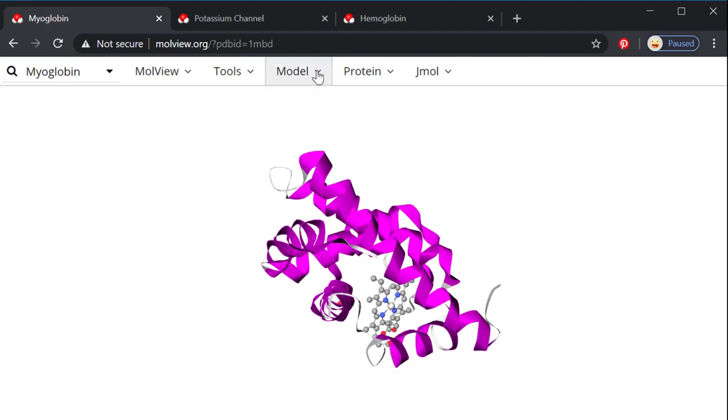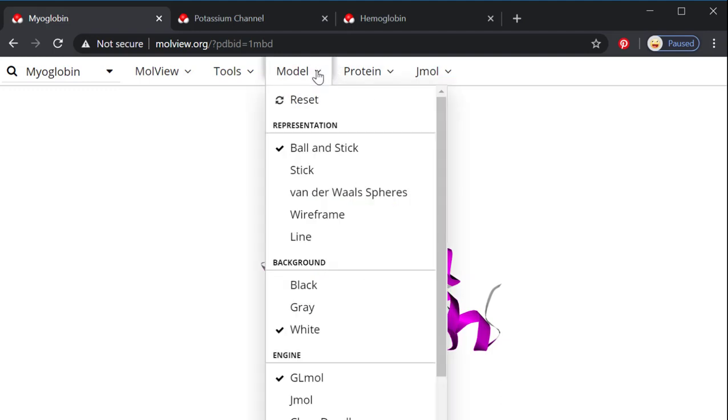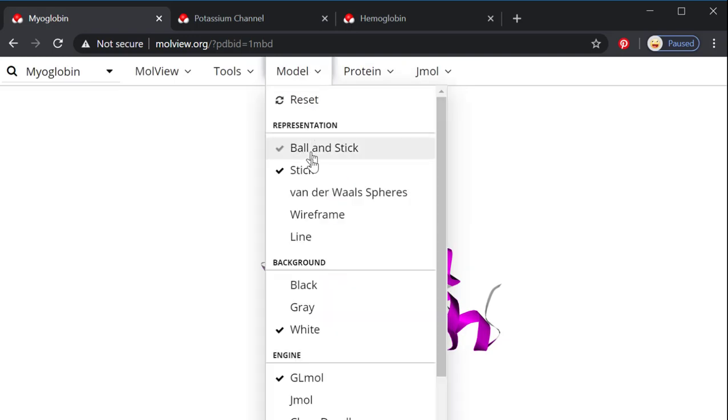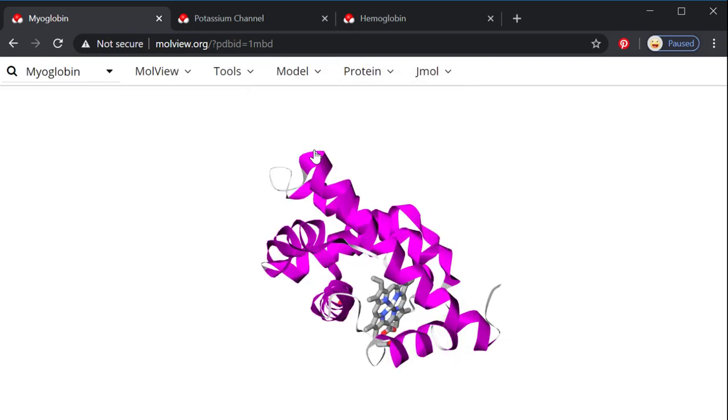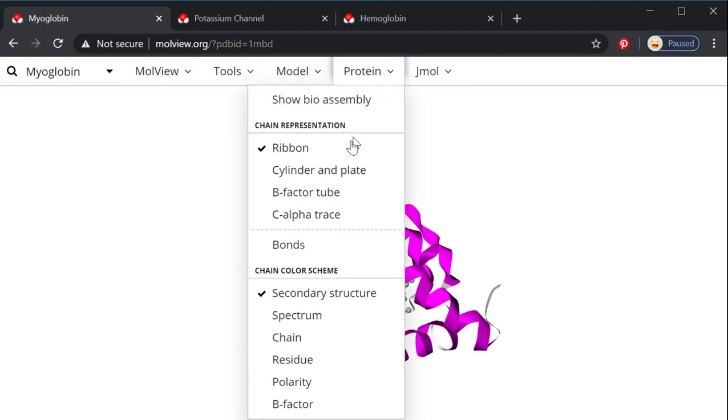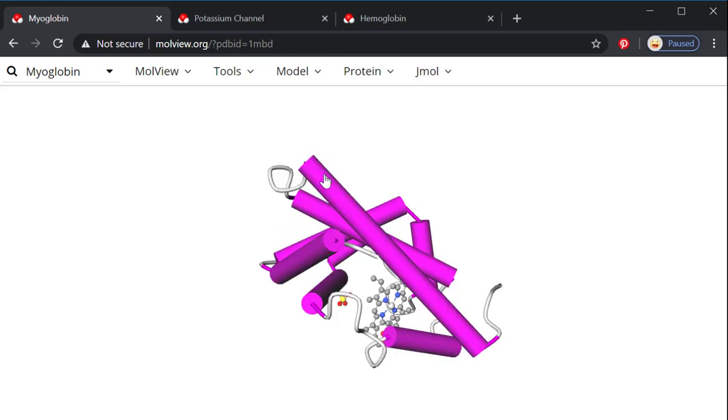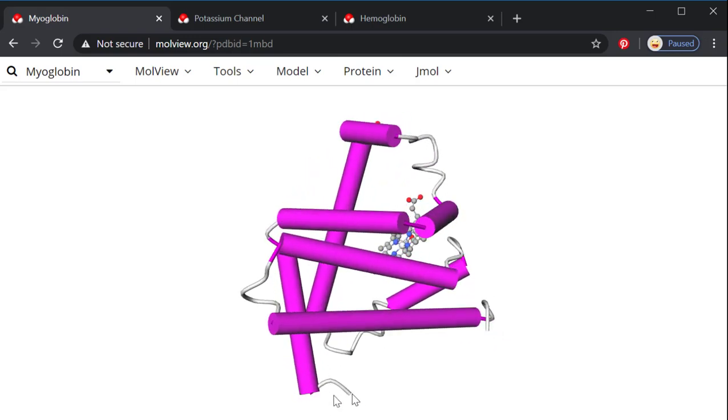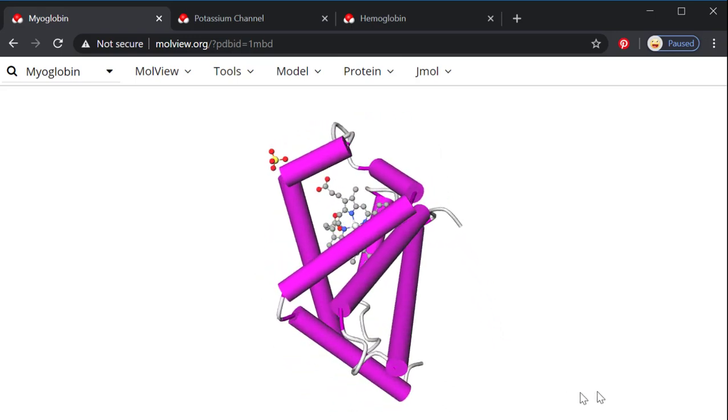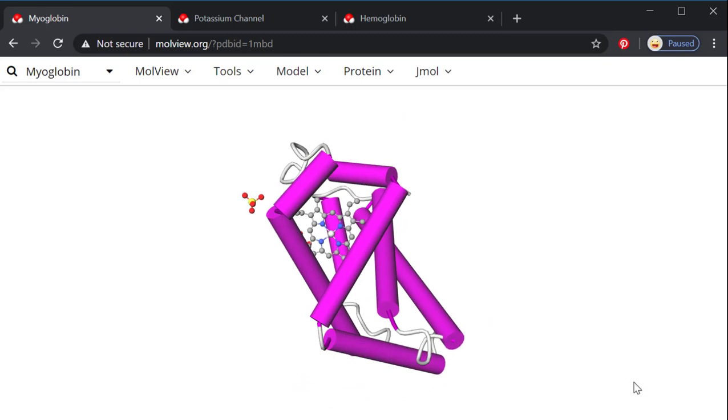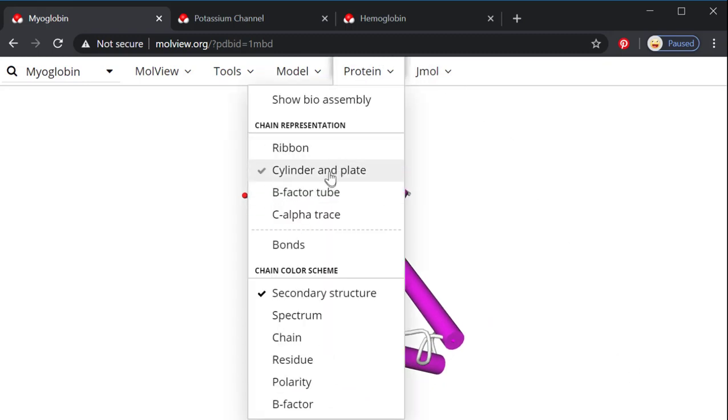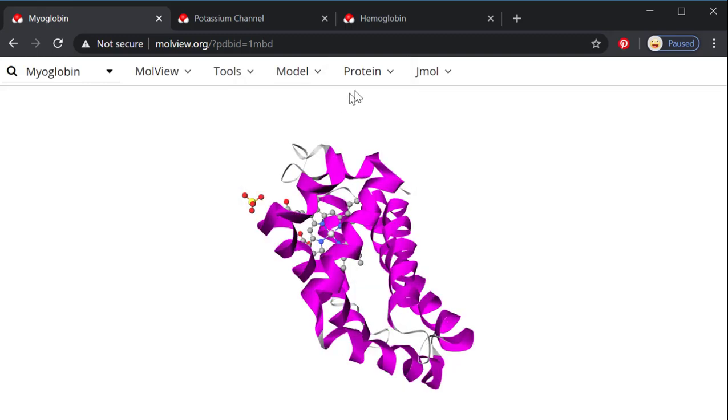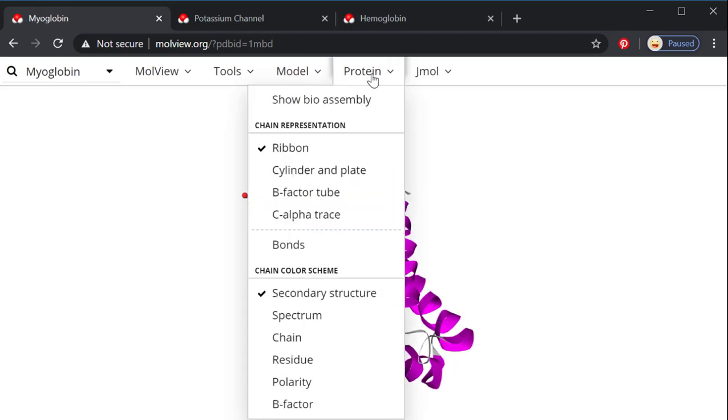If I go over here into the model, I can change how the center is looking, and then protein is where you can have some fun. So we're looking at a ribbon diagram, that's what you'll see in your textbook, but we can also use this other way of visualizing our proteins. So that was called the cylinder and plate. You can also switch back to ribbon here.